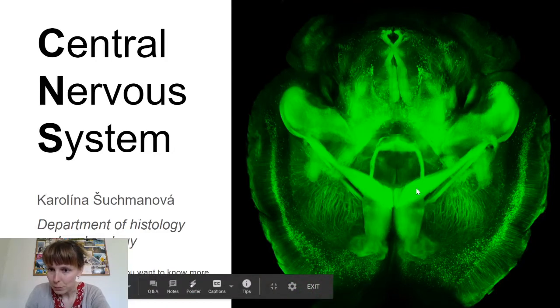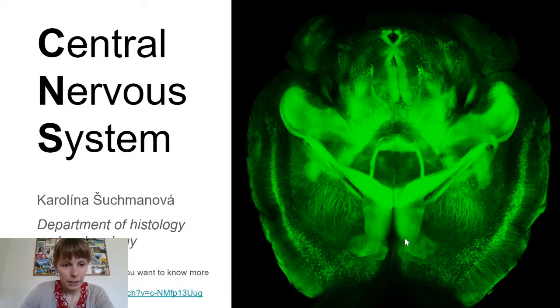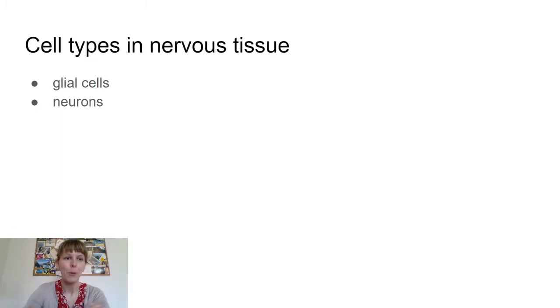This should make you curious about the brain. We will be covering a little bit of theory, and then we will be looking at the online slides.